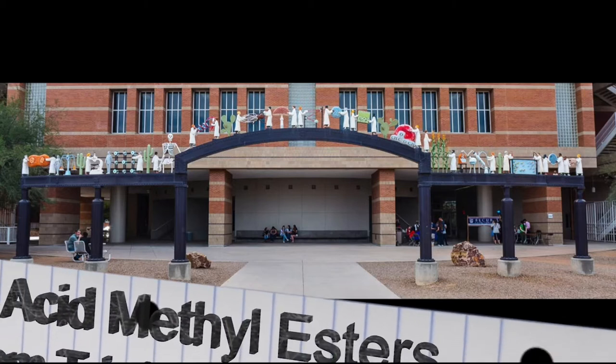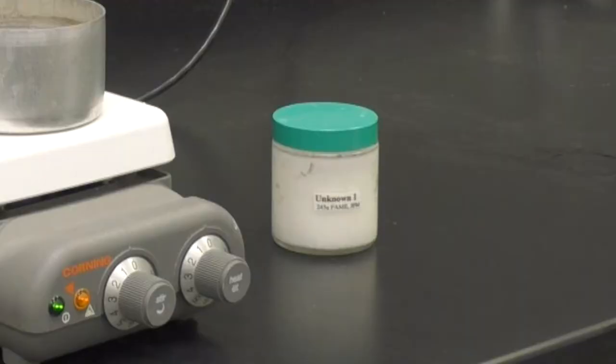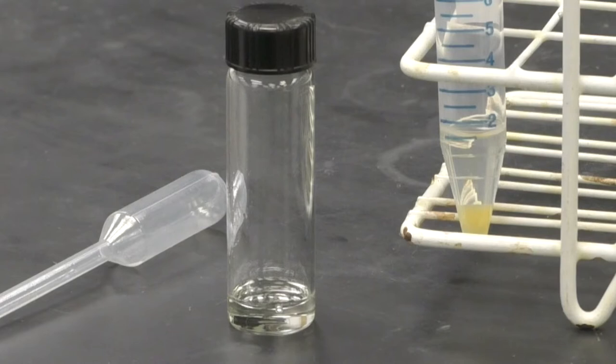This video will demonstrate the proper procedure for the transesterification process. You will be working with an assigned unknown triglyceride, which will produce a specific fatty acid methyl ester, allowing you to identify the starting material.